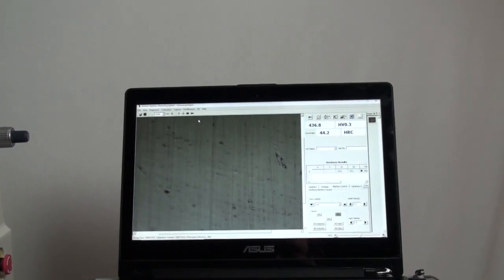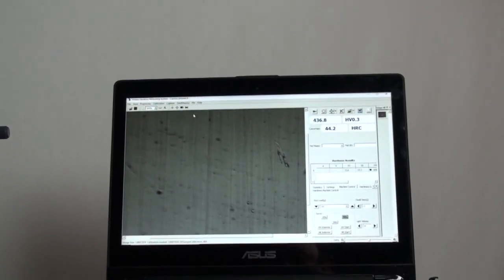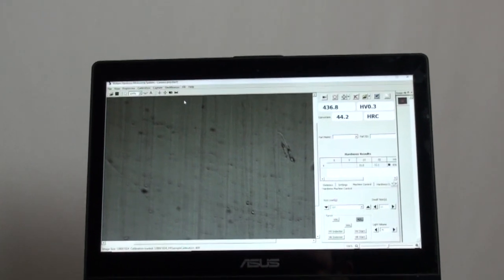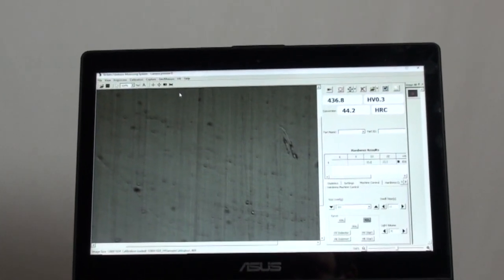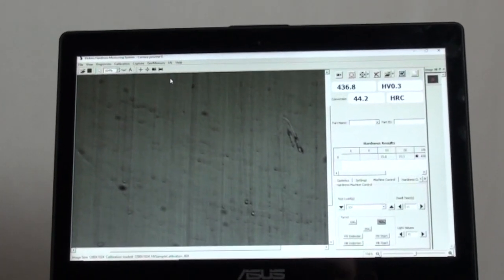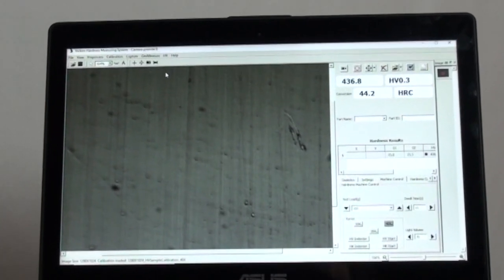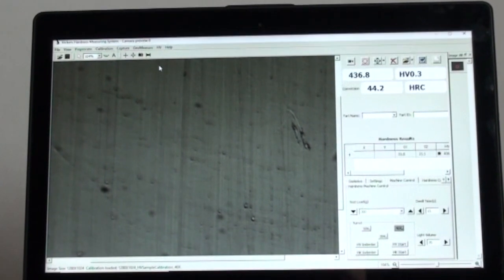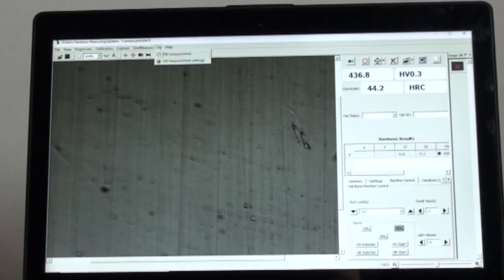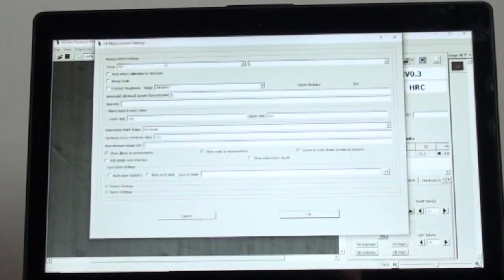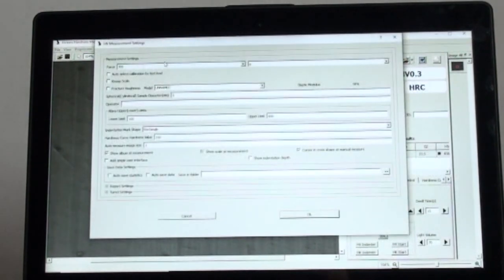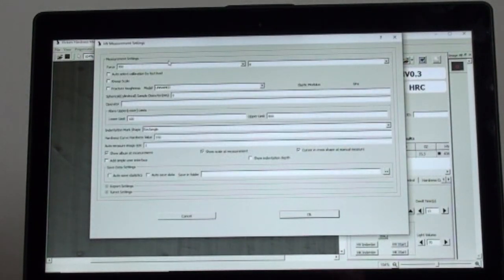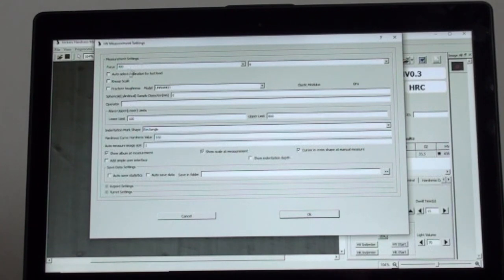Let's take a look at the software interface on our laptop here, which is connected to the digital camera by a USB cable. HV on top left, go to measurement settings, and you will see the force should match your weight selector settings on the machine dial.